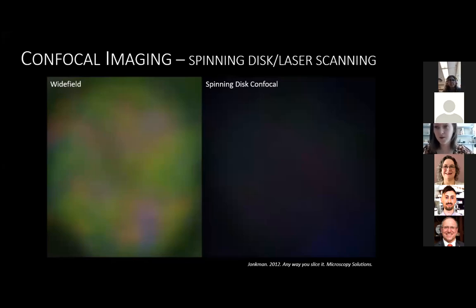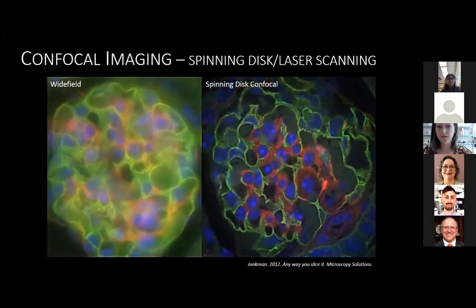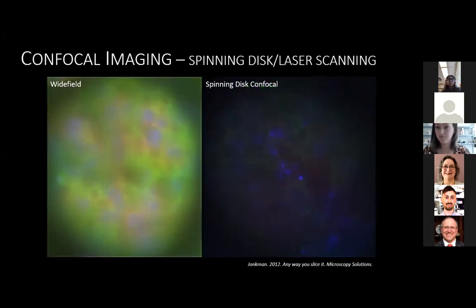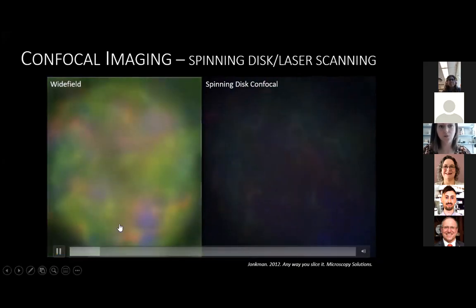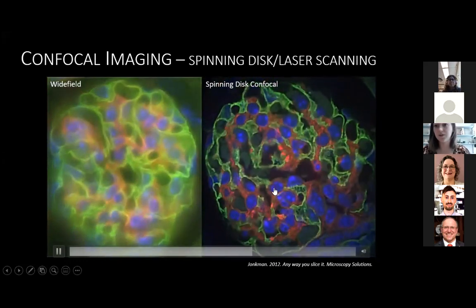One of the other things that's very popular with tissue sectioning is something called confocal imaging. Confocal is incredibly popular because it's very accessible, it's affordable, and you get really good resolution. So for example, if I were to compare traditional wide field microscopy, which is essentially using just regular light delivered to the sample, no diffraction, with all the diffraction of the light included, and something called confocal, you can actually see that the wide field has significantly less resolution than the confocal image on the right.